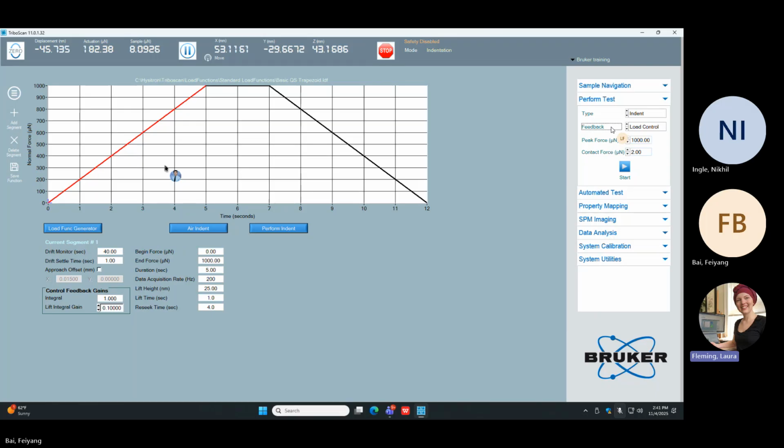What that means is that the relationship between force and voltage applied is very direct. You apply voltage to that bottom plate, and that correlates directly to so much force being pushed on the center plate, moving it. And so load control is our fastest feedback loop. What that means is that it's typically what we recommend for most users.